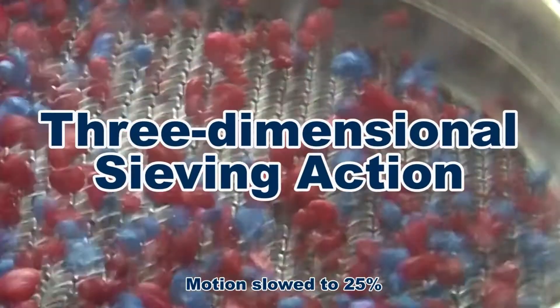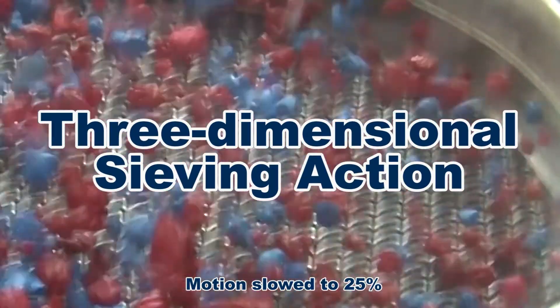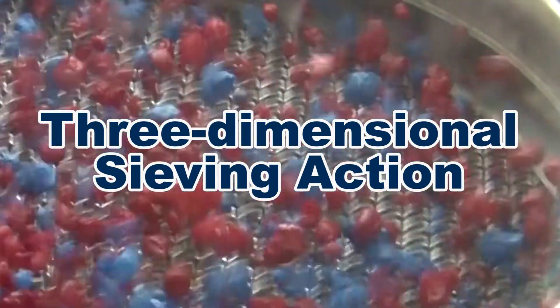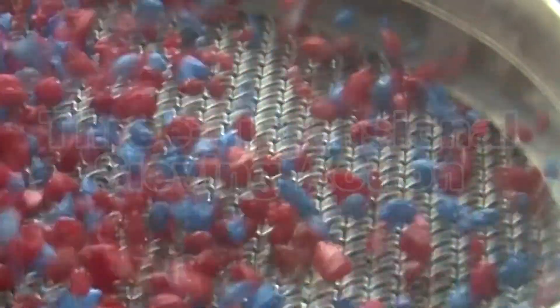The three-dimensional vibratory action of the SS10 creates a fluid bed, which evenly distributes the test sample across the sieve mesh as it continuously lifts and reorients materials to ensure the maximum number of passing opportunities.